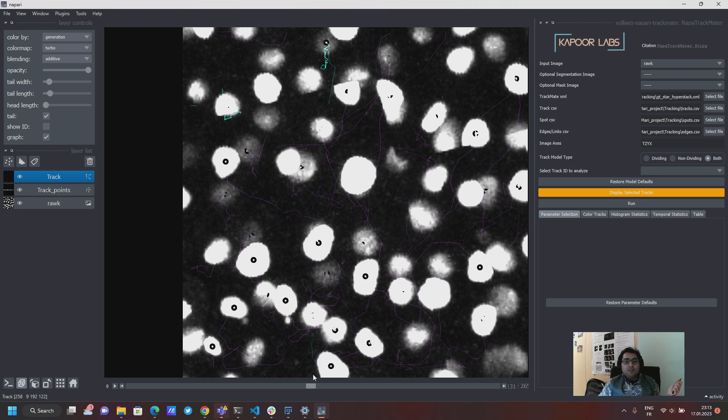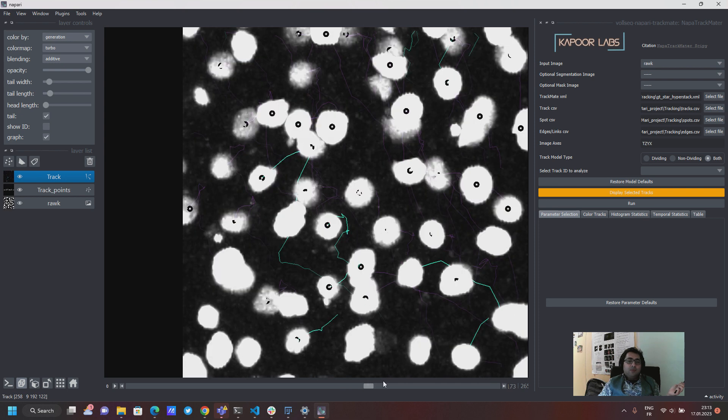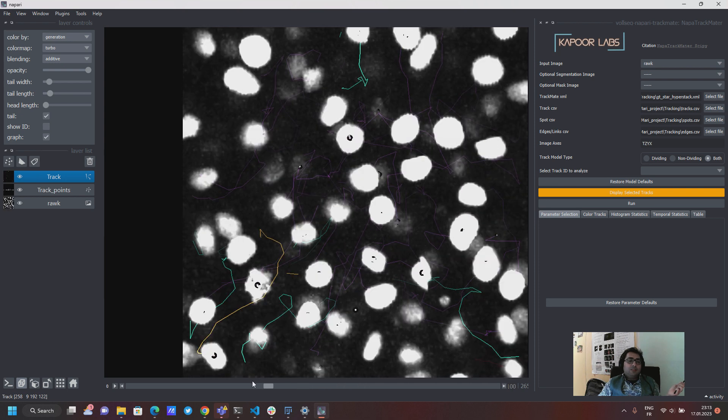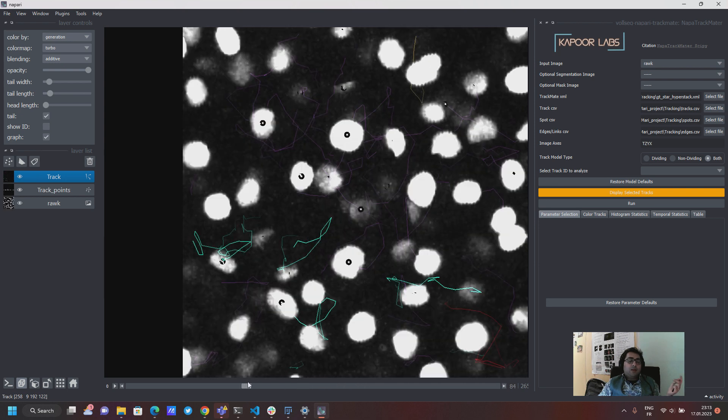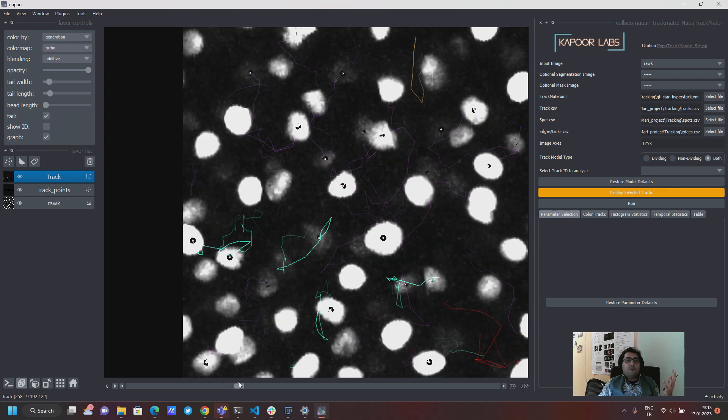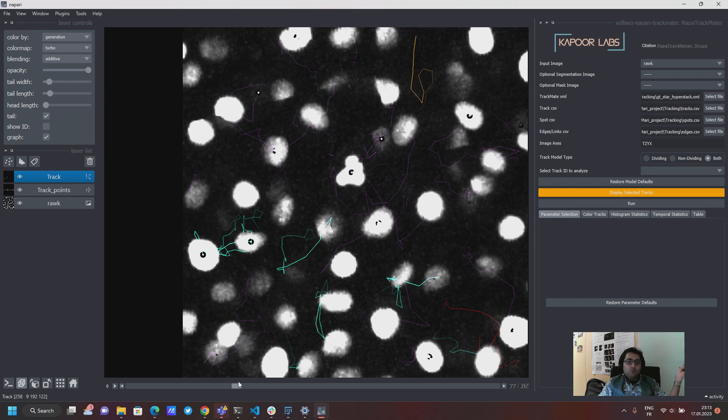And the green ones are generation two so they come from the dividing tracks. So in this way you can actually just get a quick visual view of which regions correspond to non-dividing tracks, which regions are in generation one or two already.